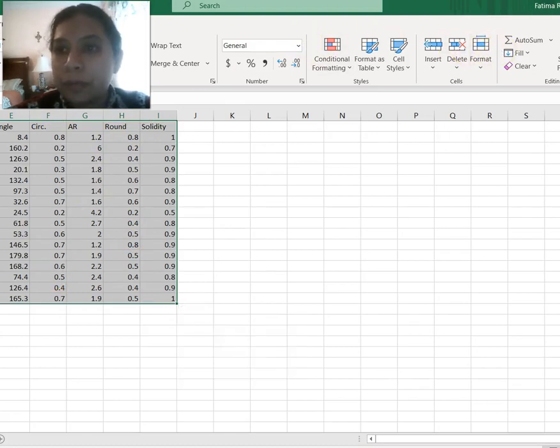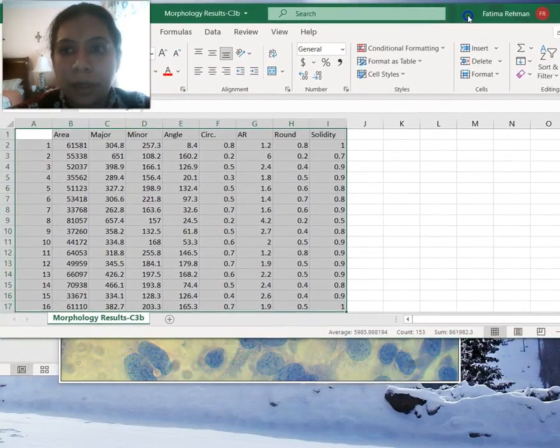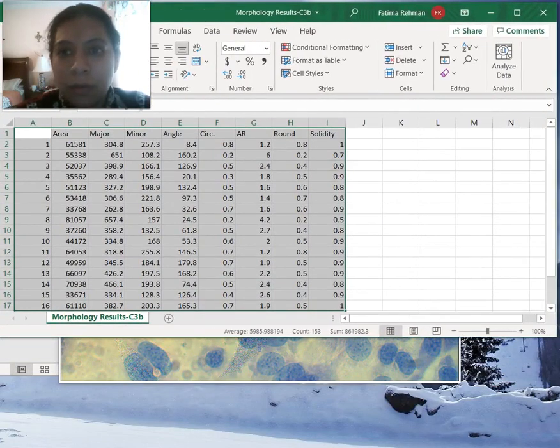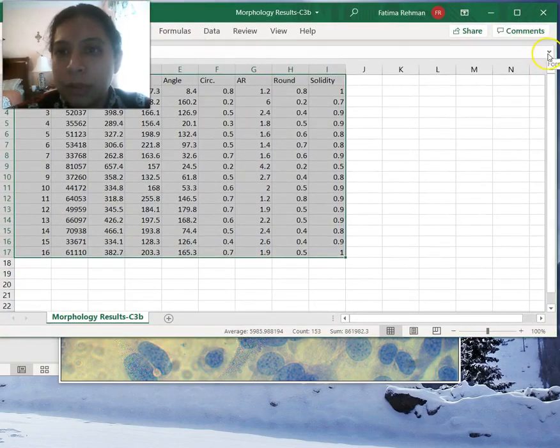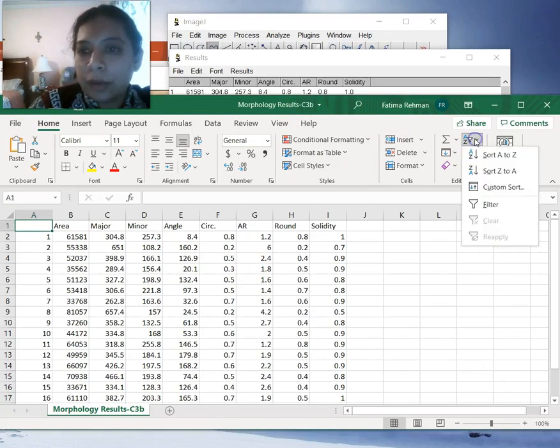So I'm going to make that appear within the field of your screen. So in here, in this top bar, you would find these formats, and you would find choices to... so in this top bar under home, you will find your sorts.